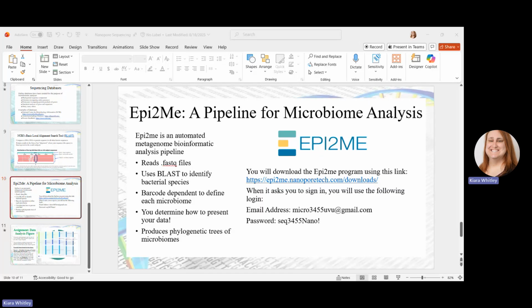So just to start, you'll hopefully remember seeing this slide in class that is currently being shared. You'll want to download the Epi2Me program using this link. And when you sign in, you want to use the following login.